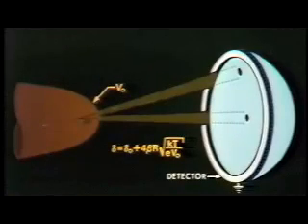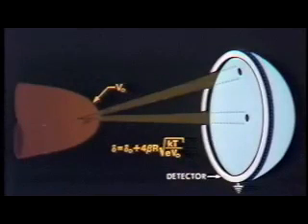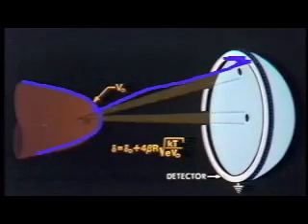To remind you again about magnification, remember, we have a highly curved surface of this wire, and we allow our ions to travel radially to a detector. Now, we might ask ourselves, what constitutes resolution in this microscope? How can we see atomic detail?